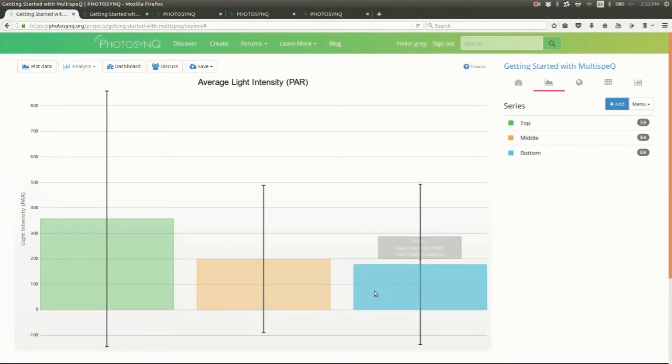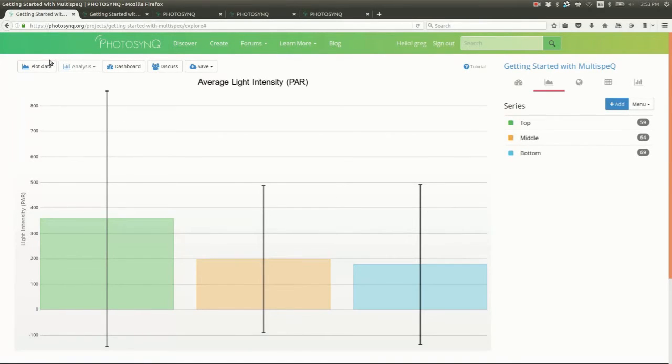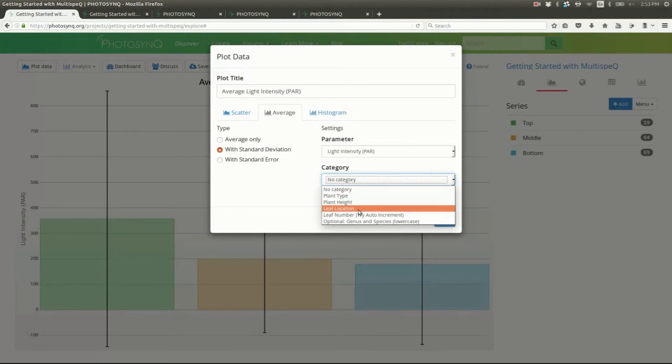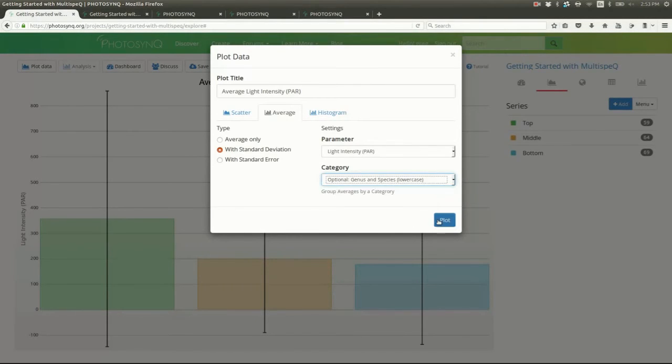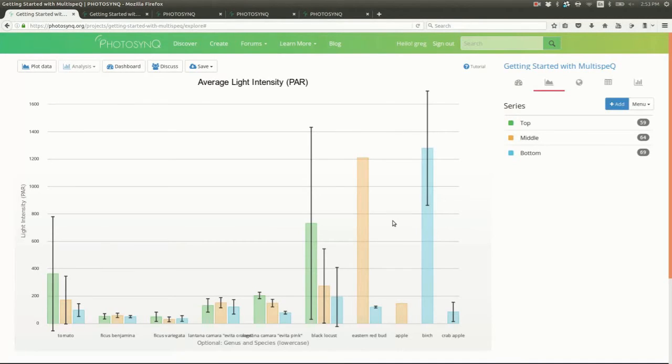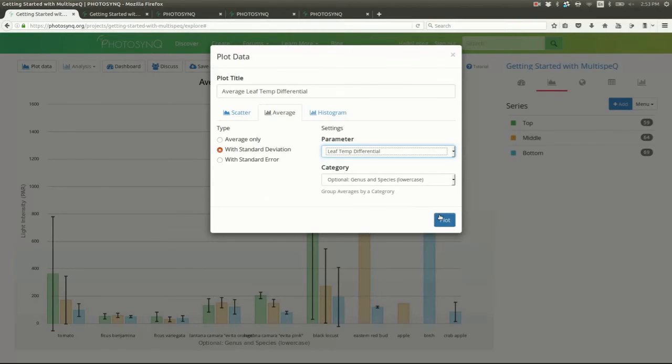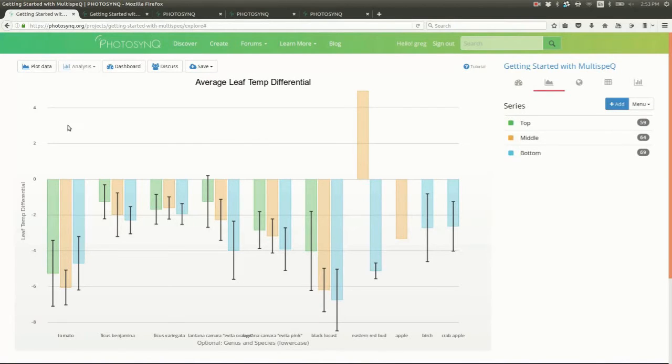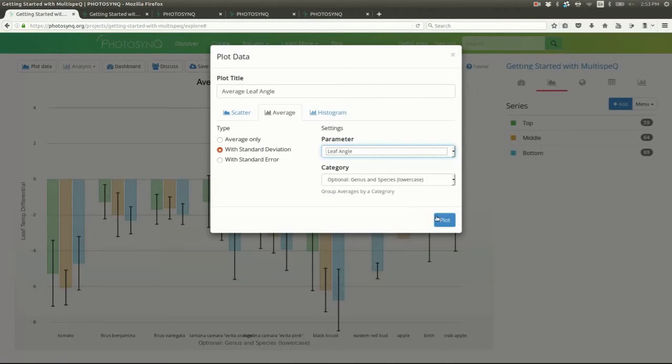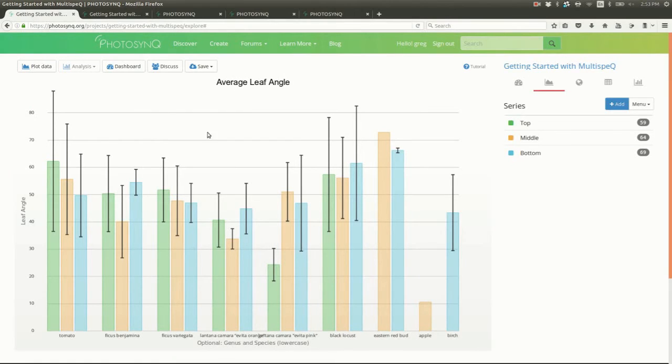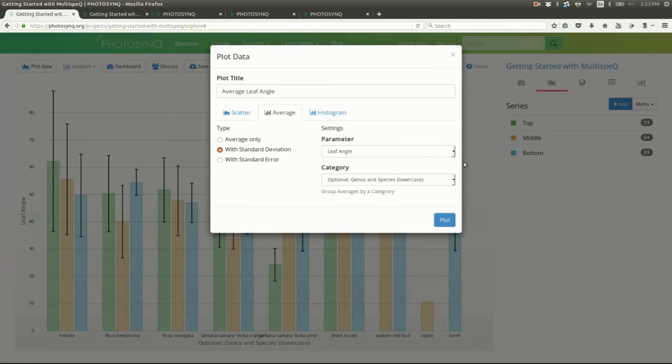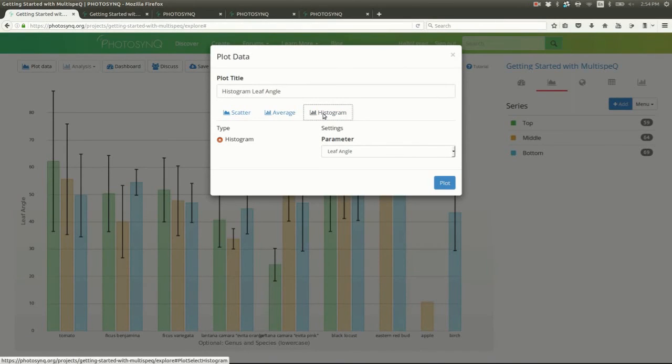Now let's compare across different species. Now let's see leaf temperature. How about leaf angle? There's a large range, so let's view it as a histogram.